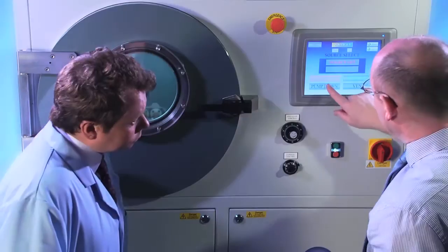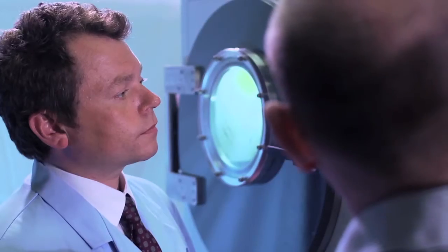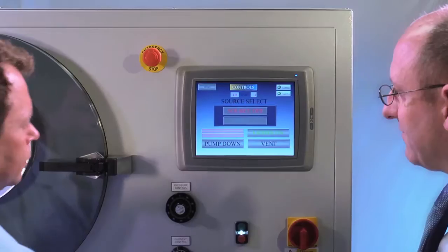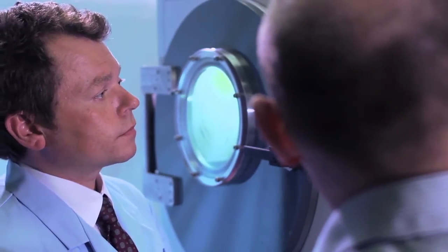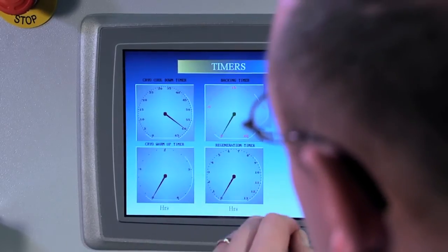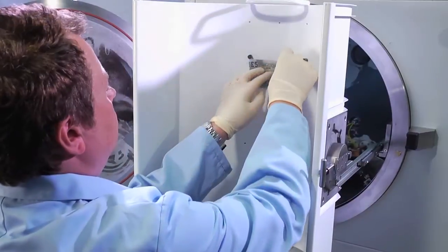WEST Technology has also developed a new PLC control system unique to the VMD560, providing an operator-friendly touch control screen that's so easy to use it takes less than an hour's training for an operator to get good results.